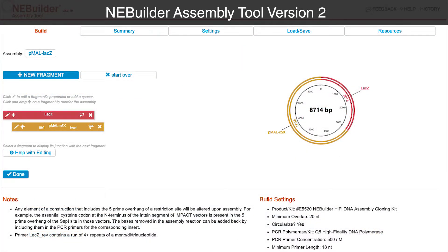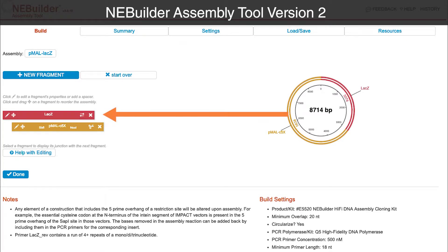In AnyBuilder version 2, vectors are treated similarly to any other fragment with minor exceptions. This is reflected in the display, as the vector is now indistinguishable from insert fragments. The sequence of the vector, as with any fragment, is now kept intact rather than being split.